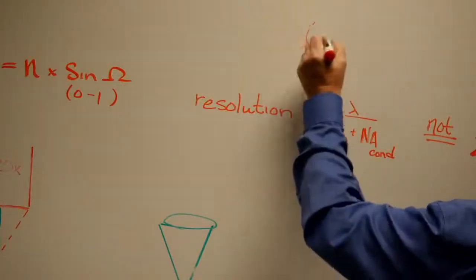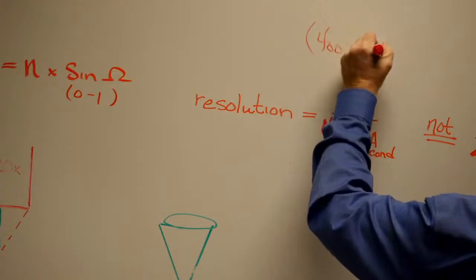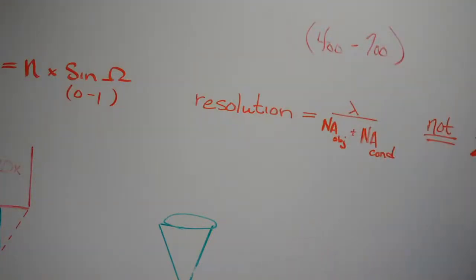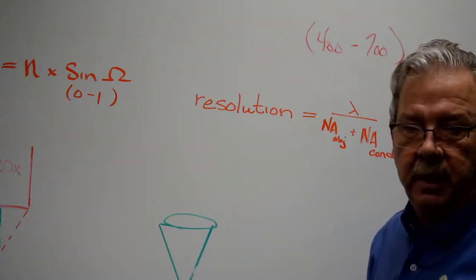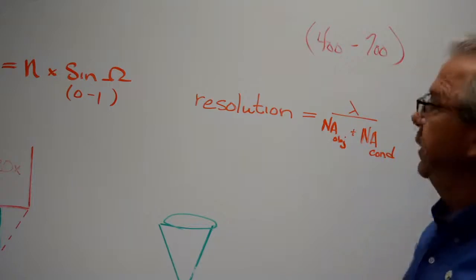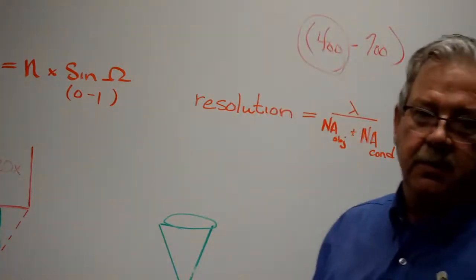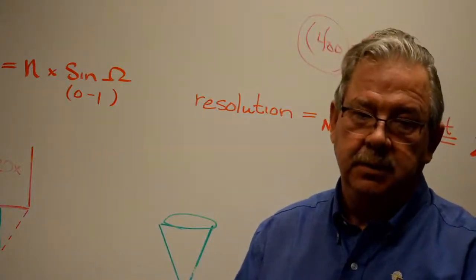So in our visible light, that number is going to run between 400 and 700 nanometers. You can specifically control that if you wanted. For example, if I was designing a tool that was trying to do critical dimension measurement, and color and contrast and everything weren't as important to me, I would try to use a light that's as close to 400 nanometers in wavelength as possible. Okay?